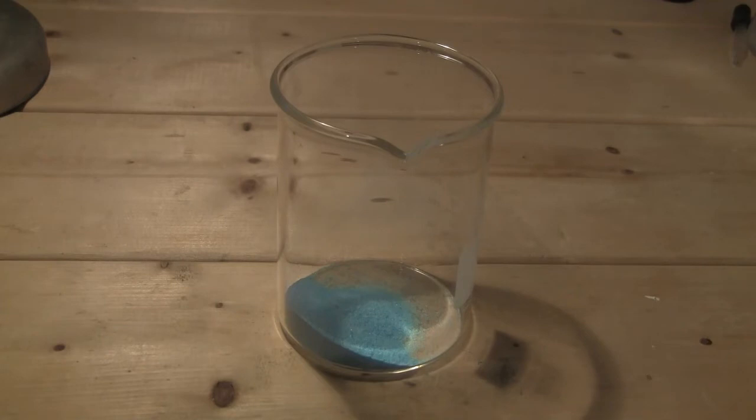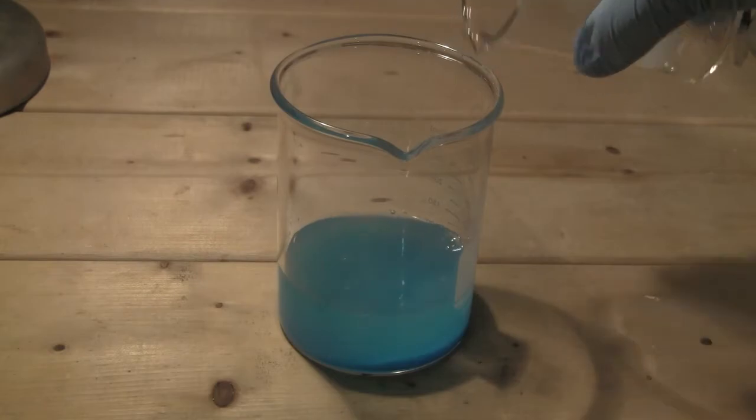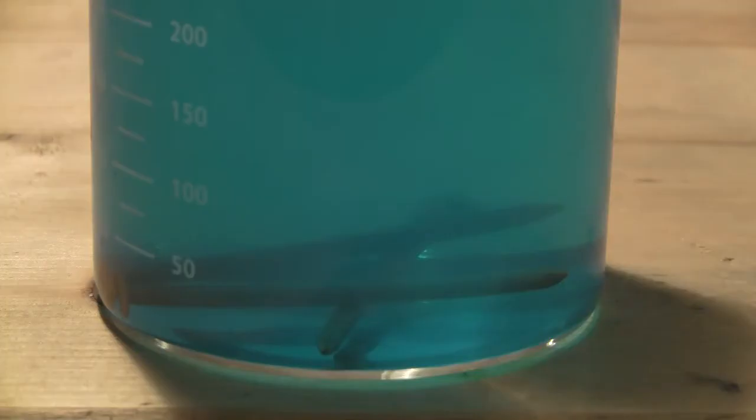To a beaker, the copper sulfate pentahydrate is added and dissolved in 125 milliliters of distilled water. Once the copper sulfate is dissolved, about four iron nails are added to the solution and allowed to sit.